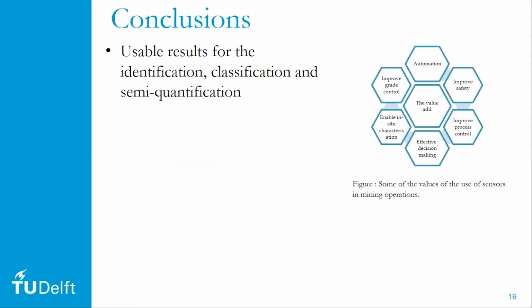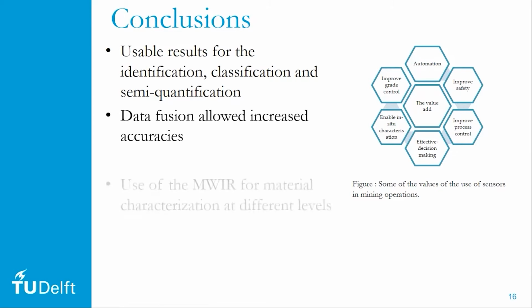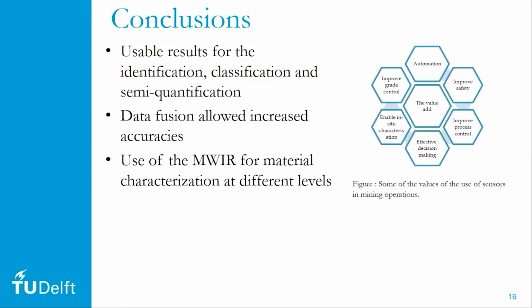Before I finish my presentation, I would like to mention some of the results of this research. Usable results were achieved for the identification, classification, and semi-quantification of materials using infrared and other technologies. The mid-wave infrared and data fusion allowed increased accuracy compared to the individual data sets. And the mid-wave infrared is used for the characterization of materials at different levels.